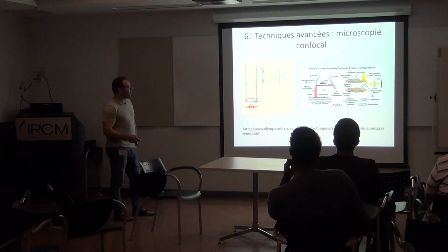While you have the confocal spinning disc, so it's a disc which has many pinholes like this.